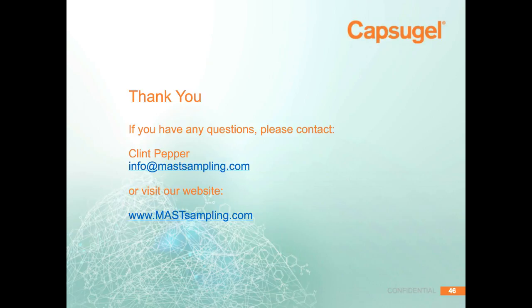Okay, thank you. Do you support other chromatography platforms other than the Waters Patrol system? So the Waters Patrol system is the one where we have successfully completed integration. We also have several projects that are starting with other different UPLCs. It's really all about the interface to the software. We feel that getting the sample there physically is not going to be as challenging as communicating. So whether the company uses ChemStation or Chromeleon or whatever those other software programs are, currently we communicate through Empower to Waters.